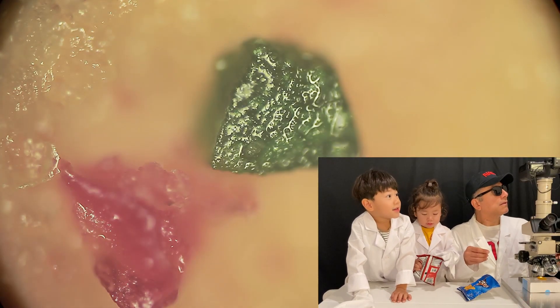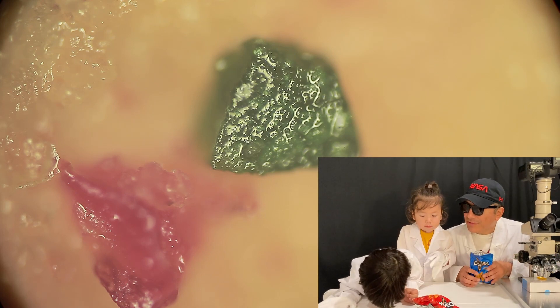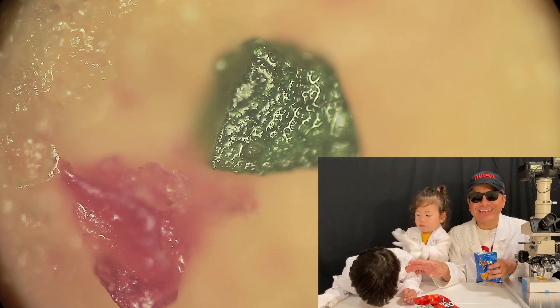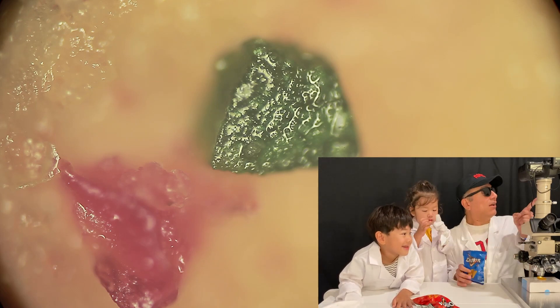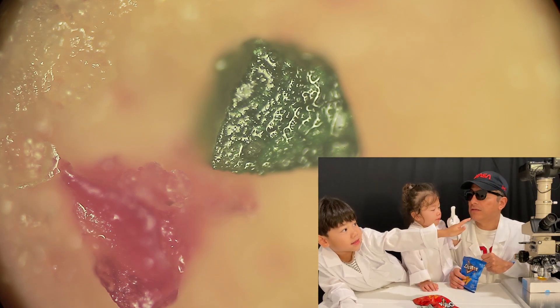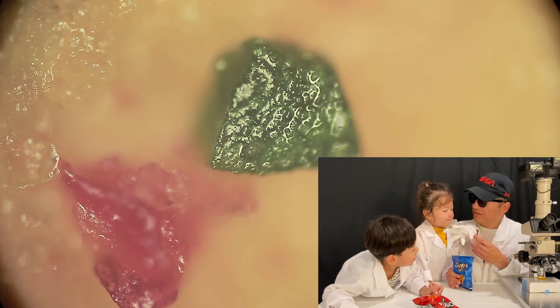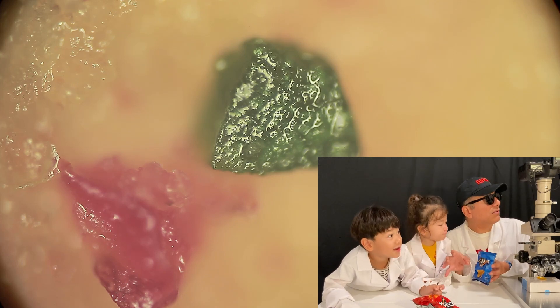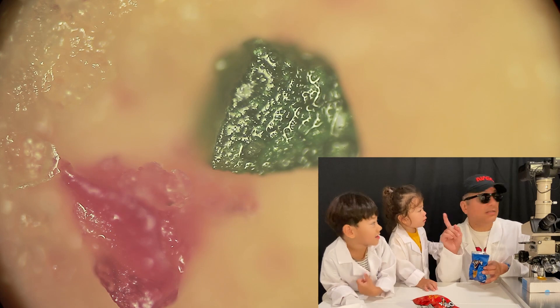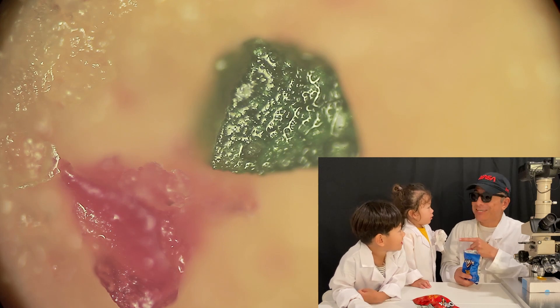And you know what — 80x, this is what 80x looks like. Oh my gosh, 80x is really close. And with 100x... okay, that's too much. So now this is the 10x. Look at that green sprinkle — it's bigger now. It's really big. It's kind of a little fat. What do you think that's made of? I don't know. Do you think that's a tomato powder, onion powder, garlic powder? I think it is an onion powder. Oh, it could be a green onion powder — that's actually really true. How about a chippy onion powder? That could be it too.